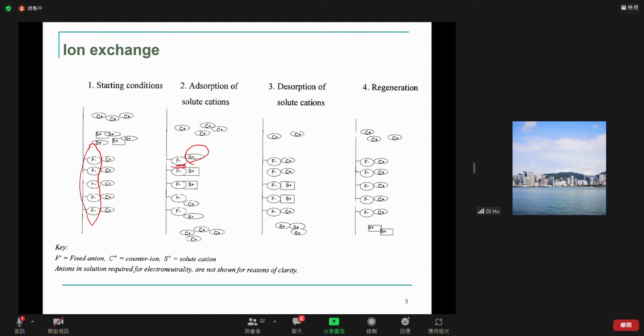Because different sample ions, if you have multiple compounds, will have different charge density, which is a very important property we will look at later, and also different polarity, they have different affinity to the stationary phase.